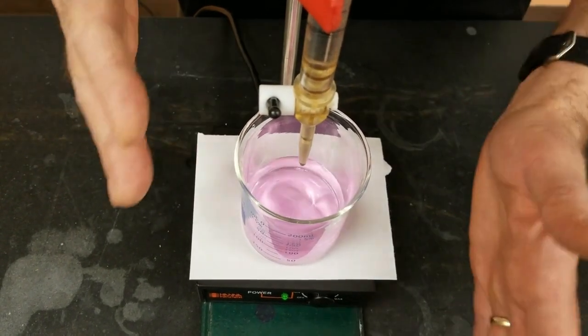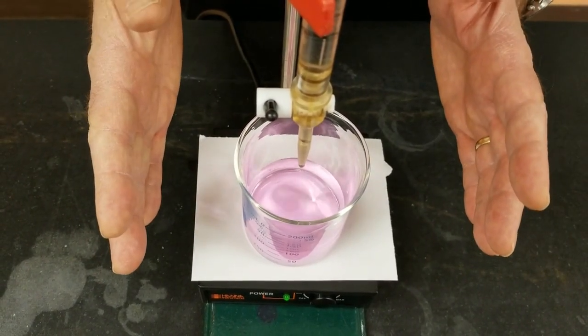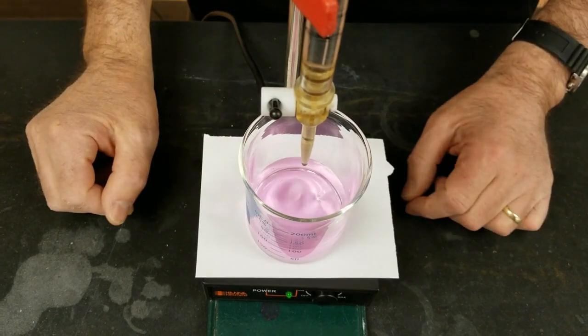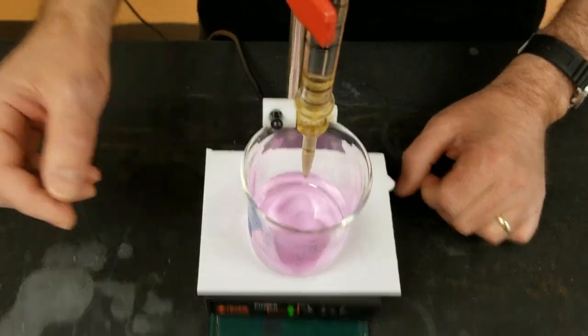And the equivalence point and the end point are literally separated by only one drop of OH- added. So we are there, the titration is over, we can read the volume.